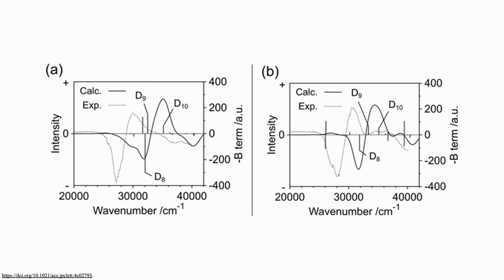So this study as a whole pretty much gave us a way to study CD without separating enantiomers or using something expensive like chiral stationary phase HPLC.